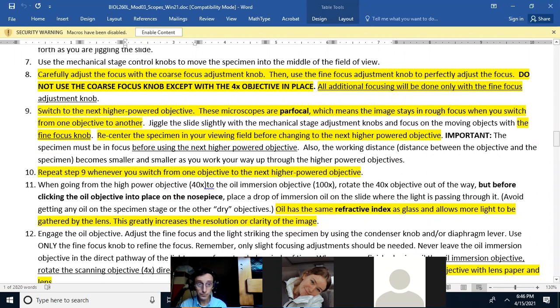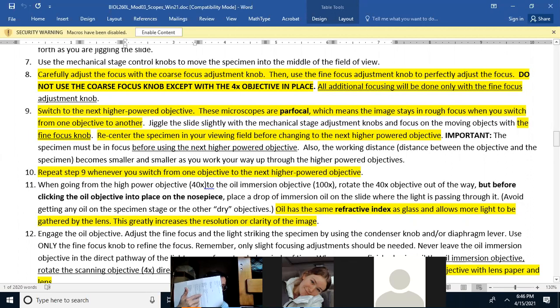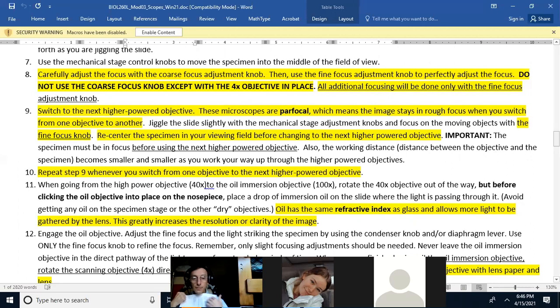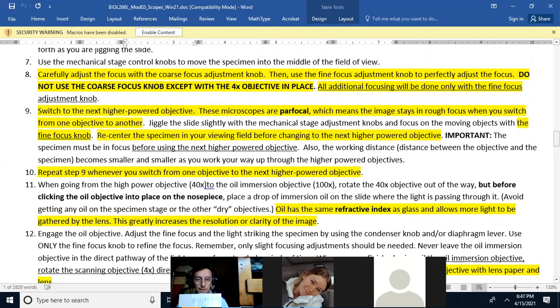When you look at an object under a microscope, move it to the center of your field of view before switching to the next higher objective lens. If you don't, the smaller field of view of the higher lens may no longer show the object. Every time you go up in power to the next objective lens, always move the object you're looking at to the center of your field of view first.